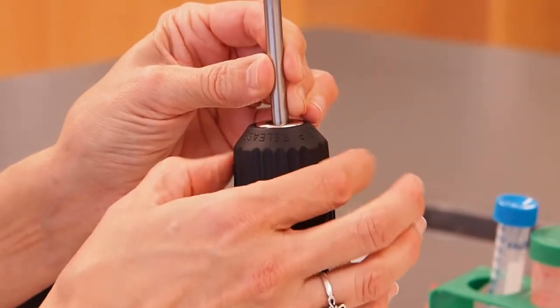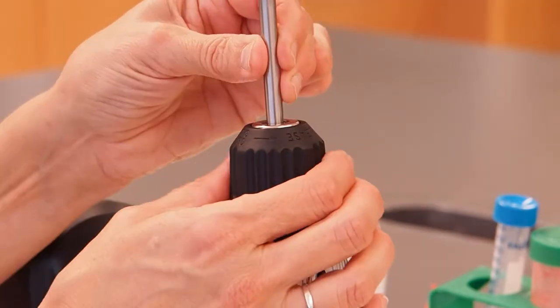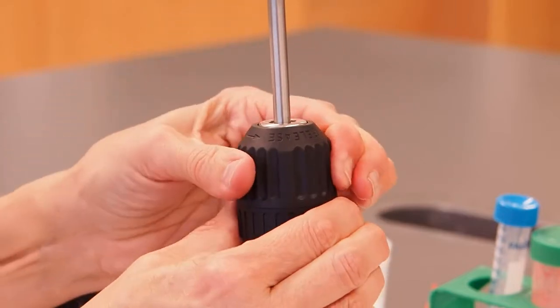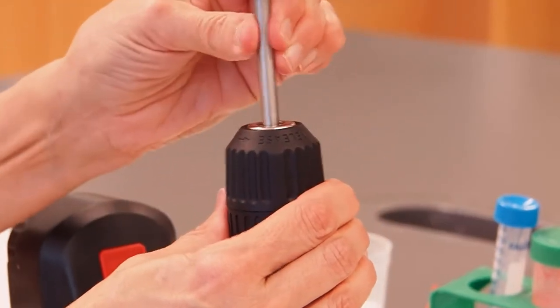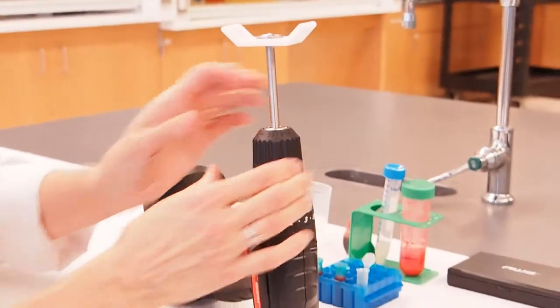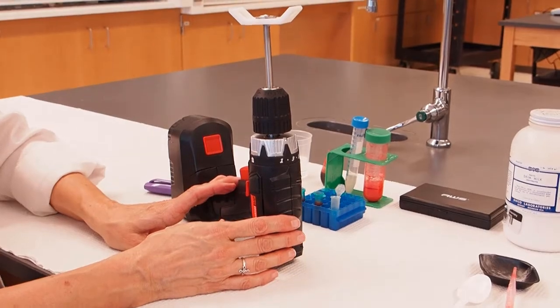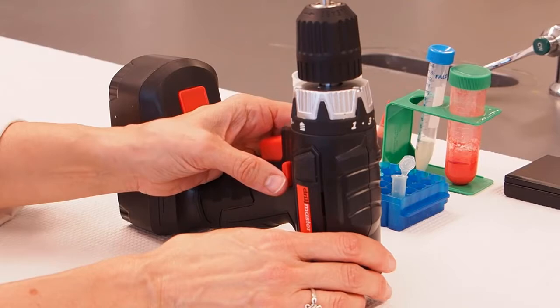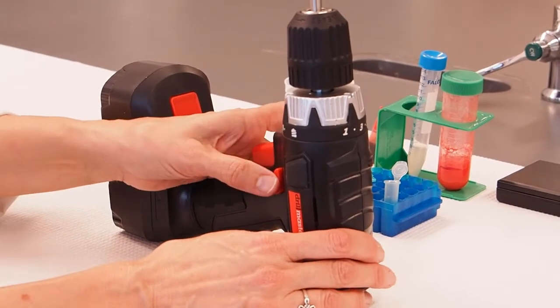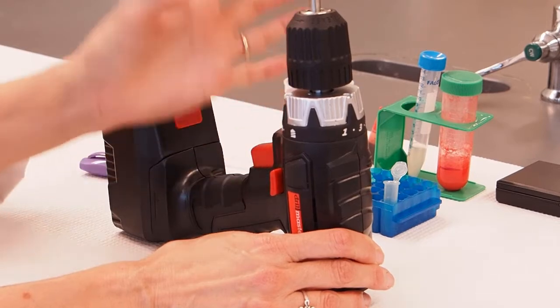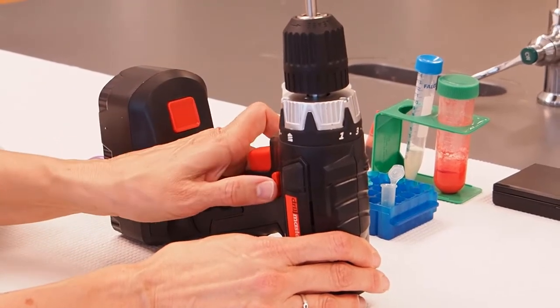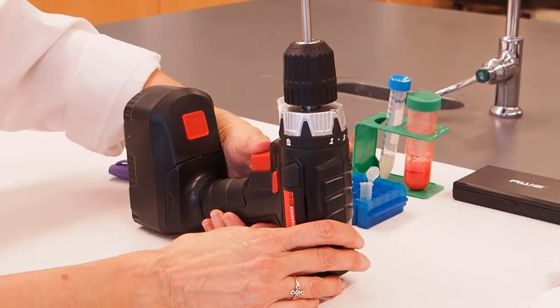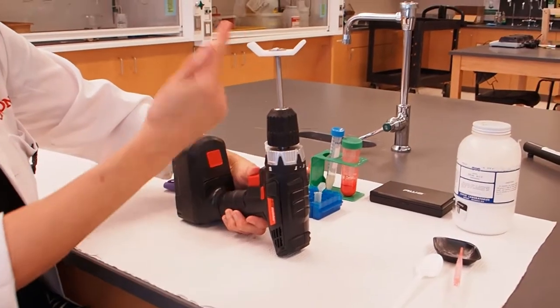You want to tighten this thing that's called the chuck until your sample holder is in there good and tight. So here I can't really move it around. Now we're going to test our centrifuge by turning on the drill. If you have this kind of drill, it has a safety button right here that when it's in the middle is off and when it's pushed to one side or another, it's on. So to turn this on, we're going to push it all the way. Then you can push the button on the drill and the drill will spin your sample holder.